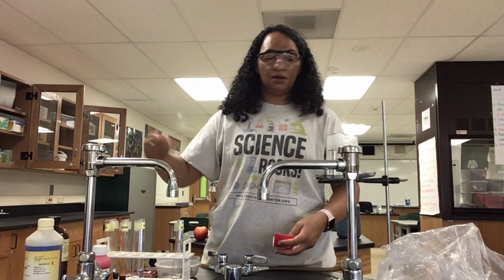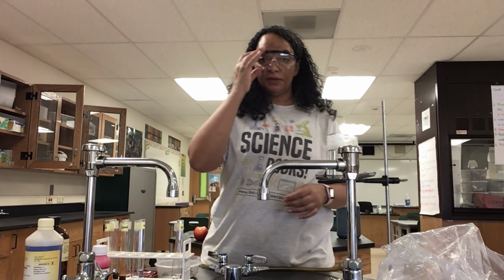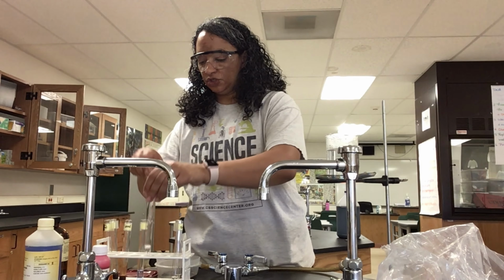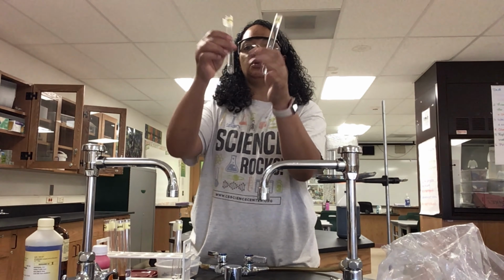Here we go. Start my gas so I can start that boiling. It should boil here in a second. And we're going to run two tests at the same time, so we're going to try to keep these straight here. Let me get two new test tubes. Okay, so I have a seed and a control.